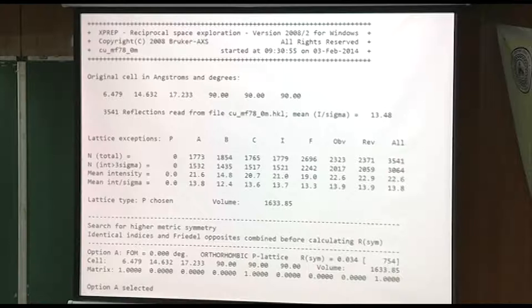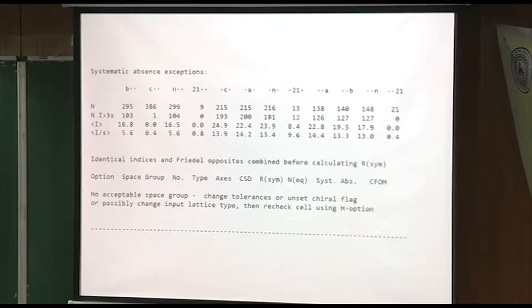Very good, much more than 6, so it's strong data. P-lattice, orthorhombic. Then what happened was systematic absence exceptions, the usual list, and then at the bottom there, bad. No acceptable space group. Change tolerances or possibly change input lattice type using H-Option.